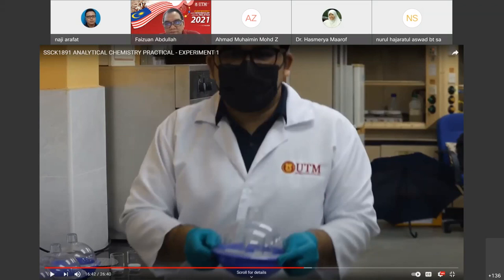Who are we going to ask? Chong Tai Sun. Okay. Before that, got some answers in the chat room. To absorb water, prevent reaction with water. Right. Silica gel absorbs humidity. All right, we have a lot of answers, but I need to hear from Chong first. What is your idea, Chong?